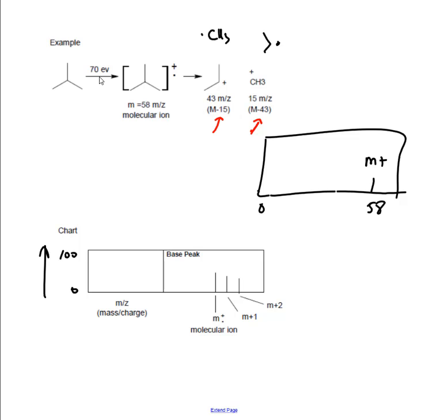So if this is the full molecule, then when this broke apart, we can see this part here as 43, but we could also consider the radical that fell apart, and that's 15. See that? 12 plus 3 is 15. So in this case, 43, because you got, again, the 3 carbons and the 7 H's. So you can see how you can look at it from both points of view, and we're going to use both of them in our learning process, and we'll see that, especially when I do problem solving with you.